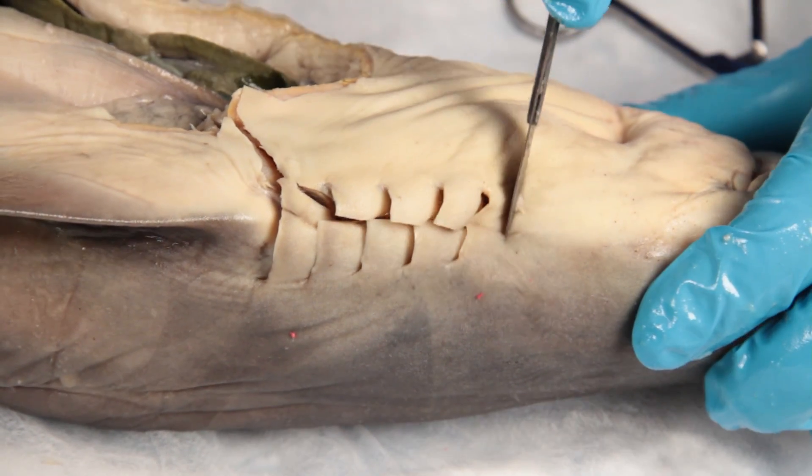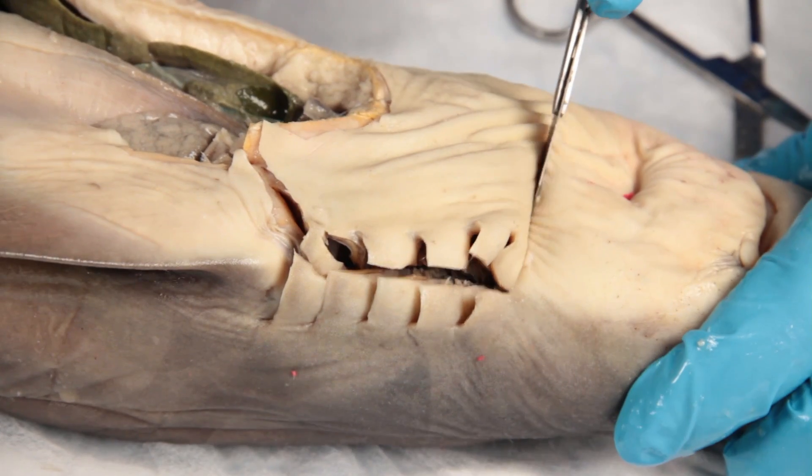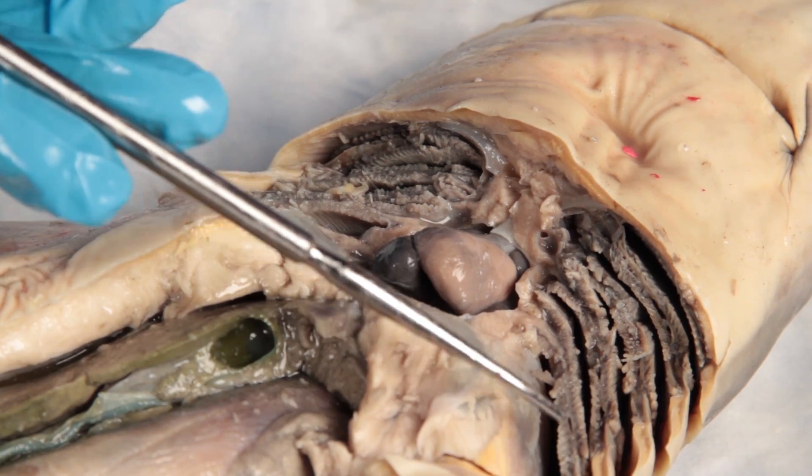You will now be able to examine the respiratory system by exposing and examining the gills and the heart.